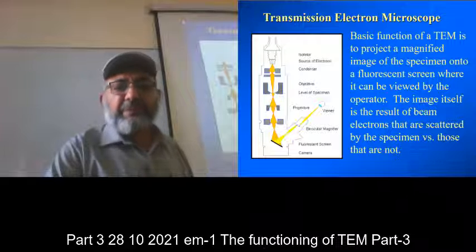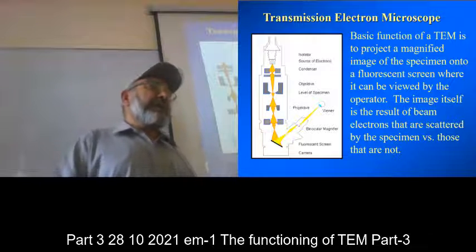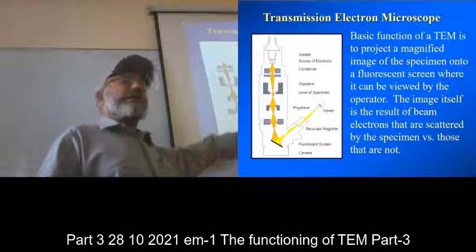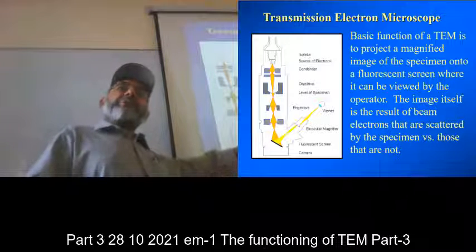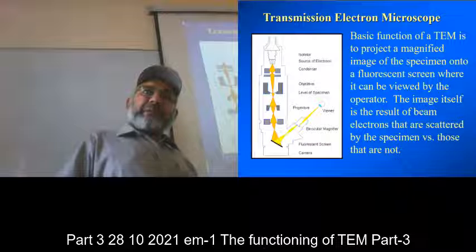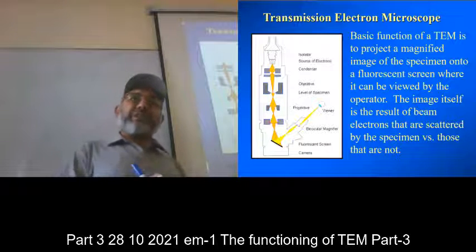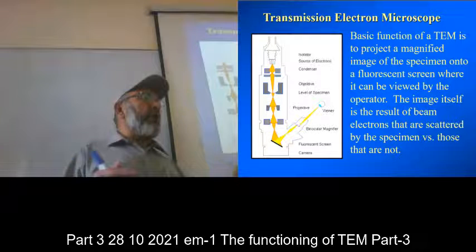Let's move forward a little bit. I told you the manual way, that when the image reaches here and you open that screen and you take the image, it comes upon the negative film, and then in our times we used to develop the film in the proper solution, then we used to fix it with the fixing solution, then the film used to be put in water for 20 or 30 minutes to wash it so that all the chemicals are washed away from it.